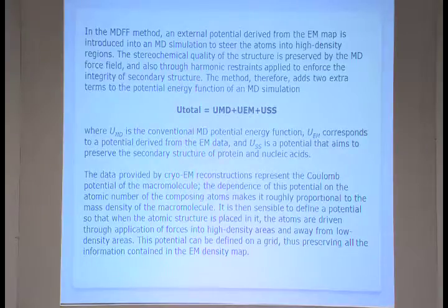So it's trying to fit the structure. It's targeting the structure to the highest density, and along with that, another term is used which keeps the secondary structure. It's a harmonic restraint, so it keeps the secondary structure intact.